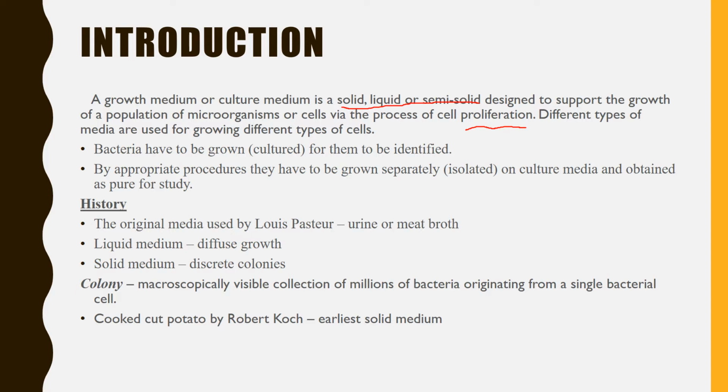So the history is, the original media used by Louis Pasteur was urine or meat broth. In the liquid media, growth occurs as a diffuse growth, and on the solid medium the growth occurs in a discrete form. So what is a colony? A colony is a macroscopically visible collection of millions of bacteria or fungi originating from a single bacterial or fungal cell.